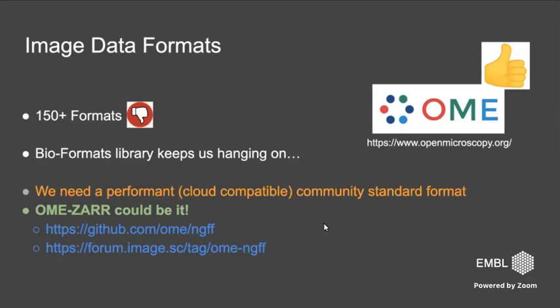Now, something about image data format. So this is really like the bread and butter, right? We need to somehow open and save images. Unfortunately, in gene sequencing, for example, I think there is this FASTA format, a standard. There is no such standard with image data, and I think it's also because it's still a younger field, bioimage informatics. We suffer here really a lot from more than 150 formats, and every microscope manufacturer makes a new format.